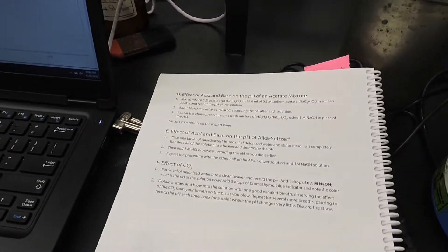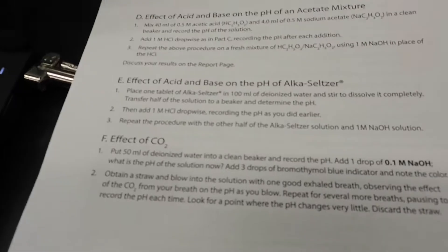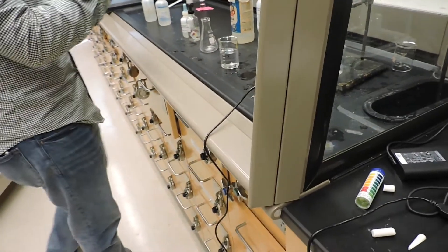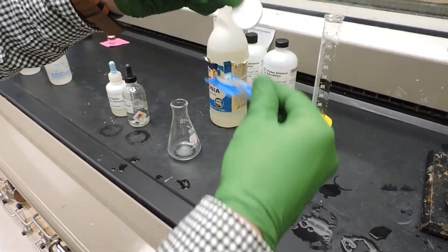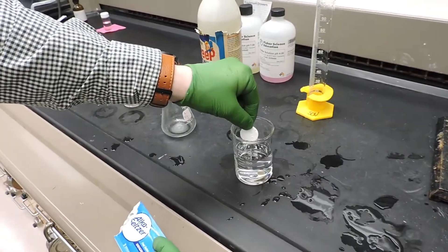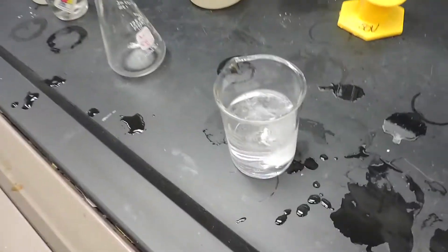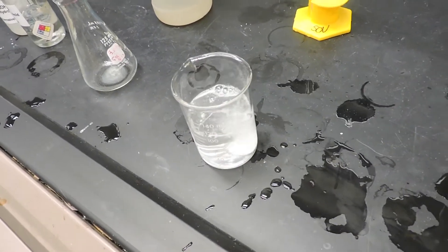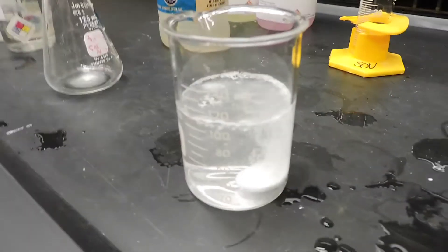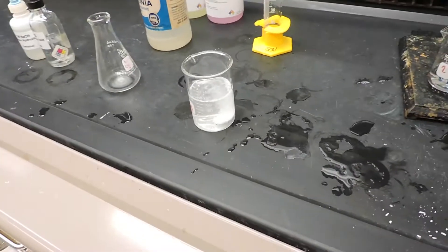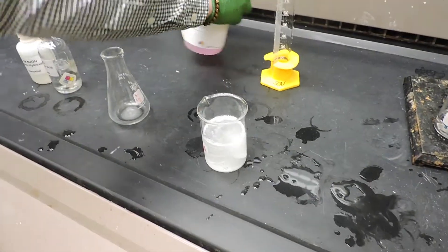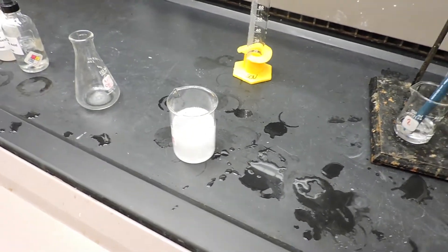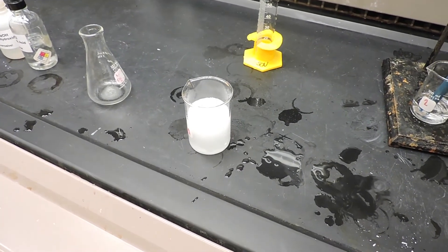Now we are on Part E, the effect of acid or base on the pH of Alka-Seltzer. We are first going to place one tablet of Alka-Seltzer into 100ml of DI water and dissolve it completely. Once this is done, we will transfer half of the solution, 50ml, into a beaker and then we will determine the pH of that solution.